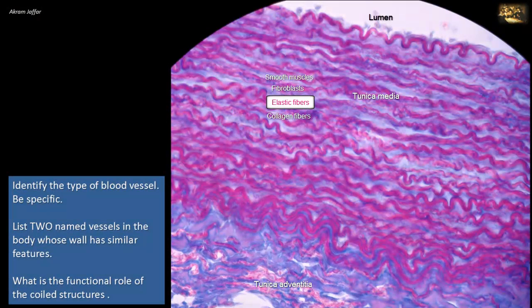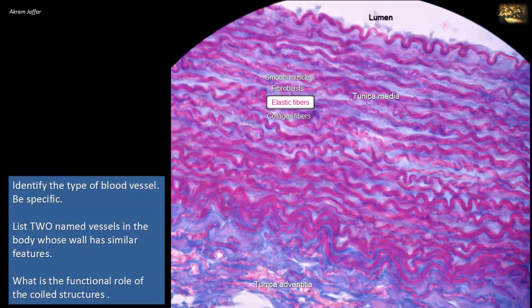Thus, we are looking at the wall of an elastic or conducting type of artery. These elastic arteries might be affected in aneurysm, which will affect the muscle cells in tunica media, and replace them by non-contractile and non-elastic collagenous fibers, resulting in weak wall that bulges and ruptures. So again, this is an elastic artery.